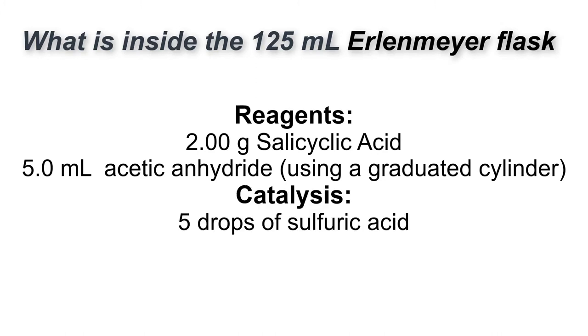For the sulfuric acid, we put five drops into our reaction. The sulfuric acid is a catalyst, which means it is recycled, so we only need a small amount of it. Those two solutions will be added again in the hood because they are highly reactive.